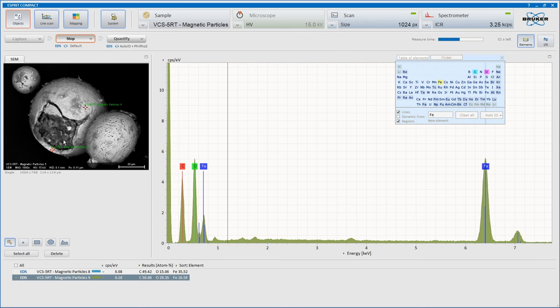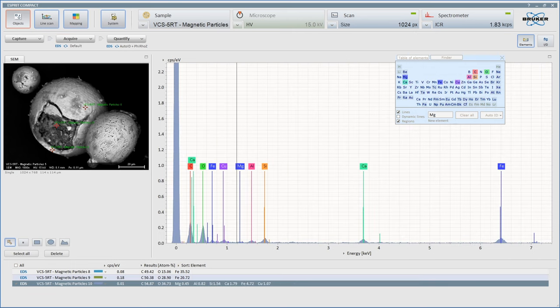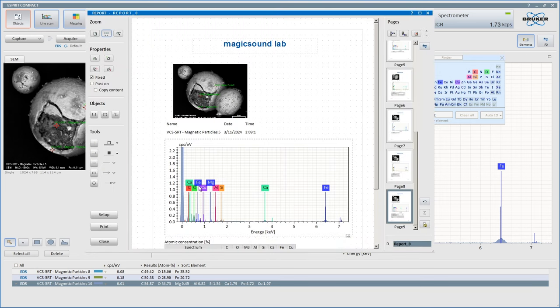Now, the interesting thing is going to come when we look at the inside of this. And I think I'm going to do a map of that because I want to get a full idea. We'll zoom into that area. I want to get a really good idea of what that is. What does it entail? I want to understand what that is. So I'll do a couple of sample spots in here, but I predict that most of it is this range of elements, but skewed to carbon. Yeah, so the story comes out: calcium, carbon, oxygen, iron, copper, magnesium, aluminium, silicon.